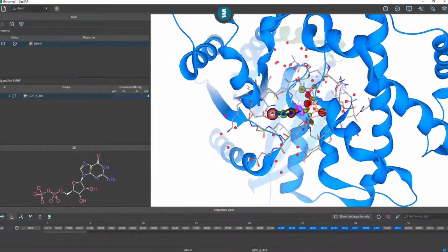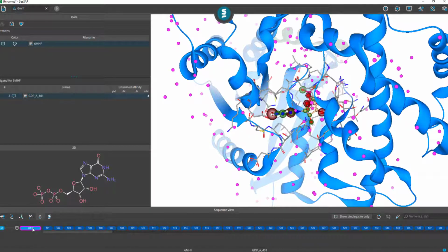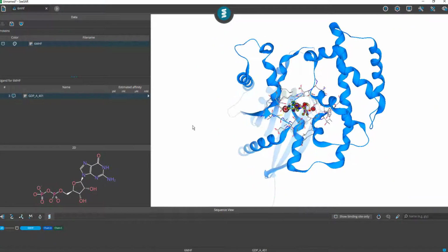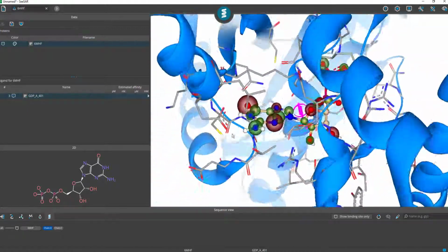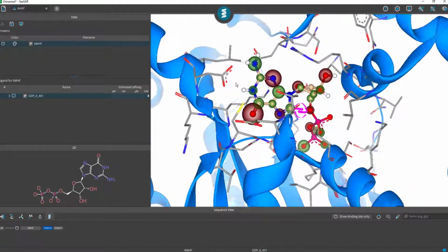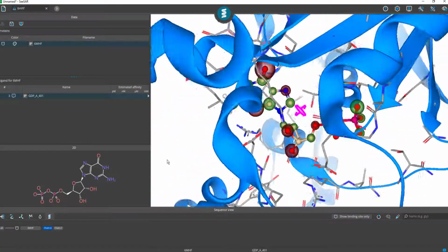but like we did before, let's quickly clear the scene and also observe how we do that really fast. Go clean off your other ligands, no metals here, a lot of waters, remove all of that. We have 2 chains, we do not need the little green peptide chain for now. Clear that off and focus view. Now we see both green and red coronas. Large red coronas indicate that these atoms contribute poorly to the affinity, while the green ones contribute positively to the affinity.